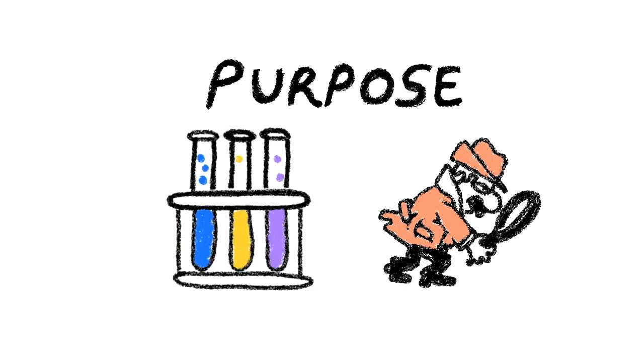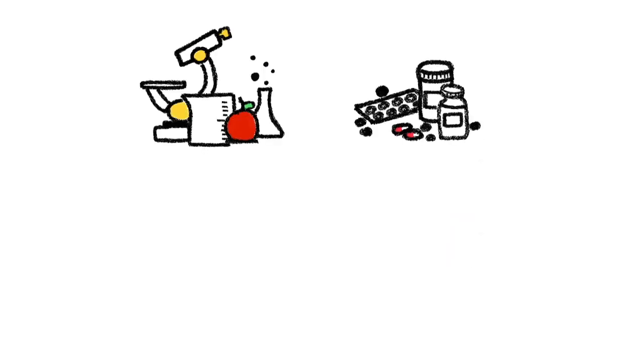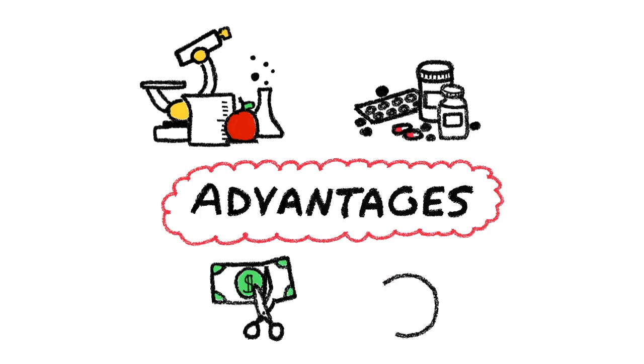This can be very beneficial for many industries that require a high standard of product quality and the need to monitor for contaminants. These industries include food chemistry, pharmaceutical production, and more. This method is also more advantageous compared to other analytical methods because it is relatively cheaper and faster to conduct, which results in a higher throughput. However, TLC is only used for initial screening of compounds and is usually used hand in hand with another analytical method to confirm the compounds of interest. Due to these characteristics, it is diversely used in larger-scale surveillance programs.